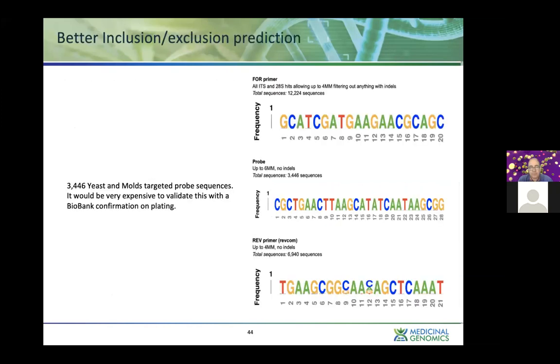The other thing you can do is take these primer sequences. These were published. You're welcome to grab them and check yourself. You can scan them against well-curated databases. The important thing is to make sure they're PacBio assemblies, because the ITS regions don't always assemble perfectly with Illumina data. But if you curate the data appropriately, you can see that we can reach thousands of organisms.